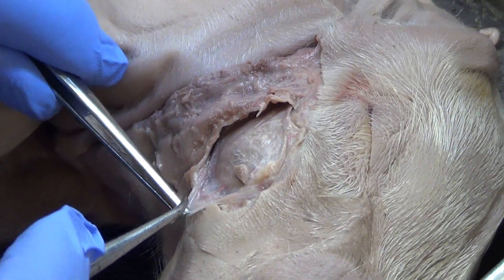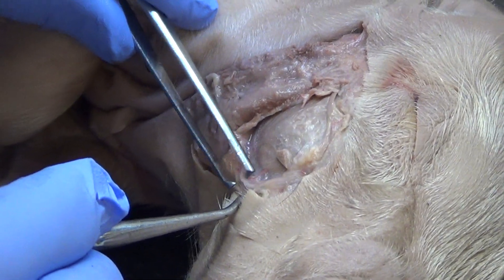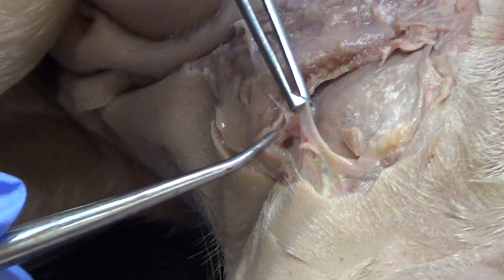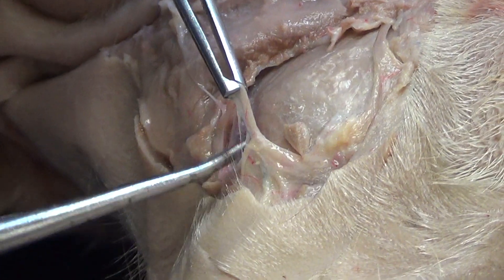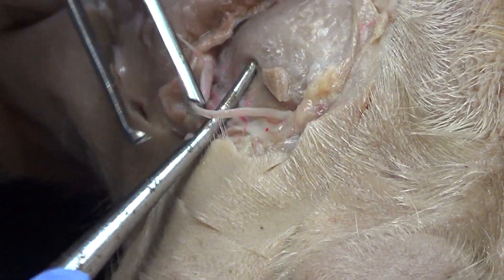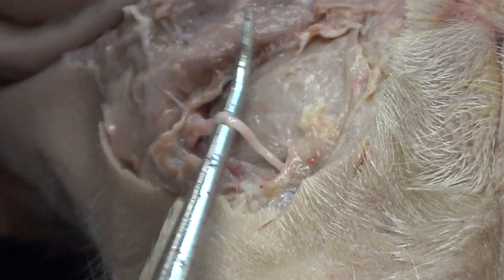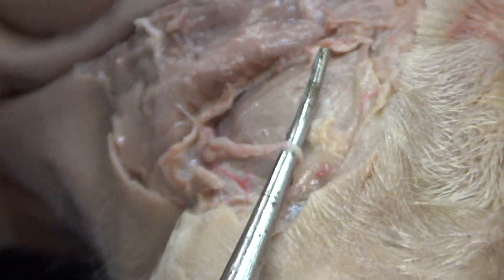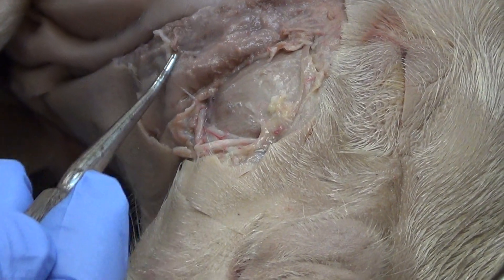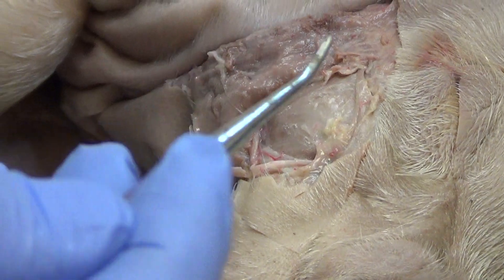Looking down here I'm starting to see it. This pig is beautiful — we bought the bigger pigs this year. There's my isolation: parotid duct, isolated. Look at where it goes — parotid gland, saliva, upper second molar, isolated.